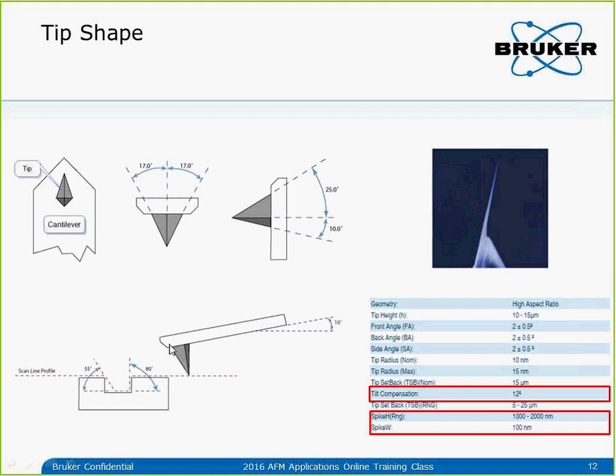The tip has this front angle and also the 10 degree tilt, and you can see one side of the profile has a very different slope compared to the other. It's not vertical as expected. So in this case, if we want to really image this deep change or a pit well to see a much sharper step, then we need to consider choosing the right probe, right?